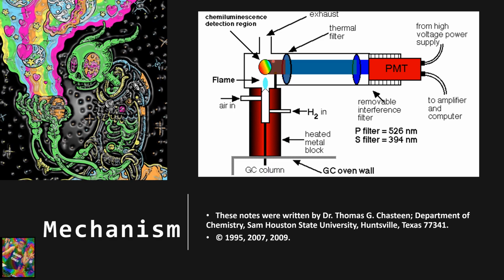The primary combustion zone of the flame is blue in color. In this region, there is no thermal equilibrium. Therefore, it is not used in flame spectroscopy. The interconal region is rich in free atoms and is the most widely used region for spectroscopy.